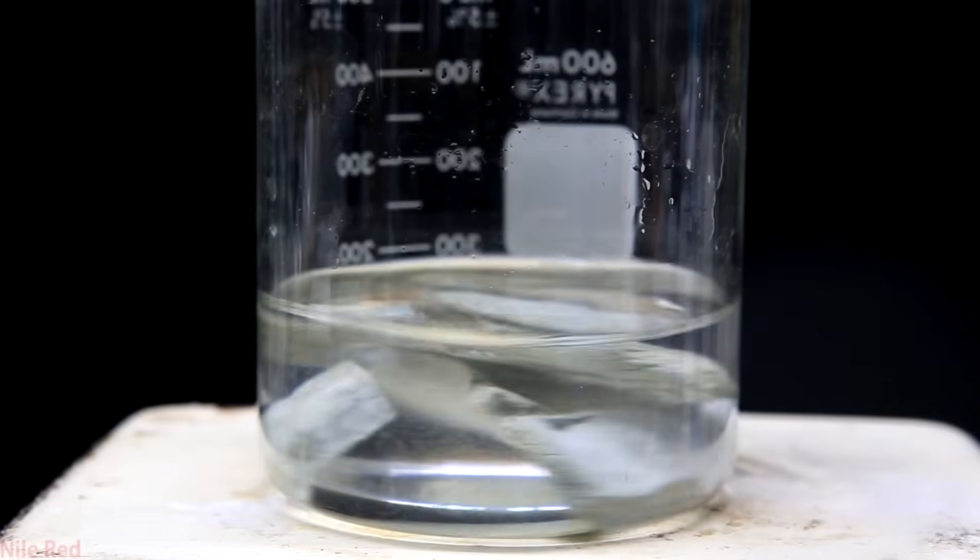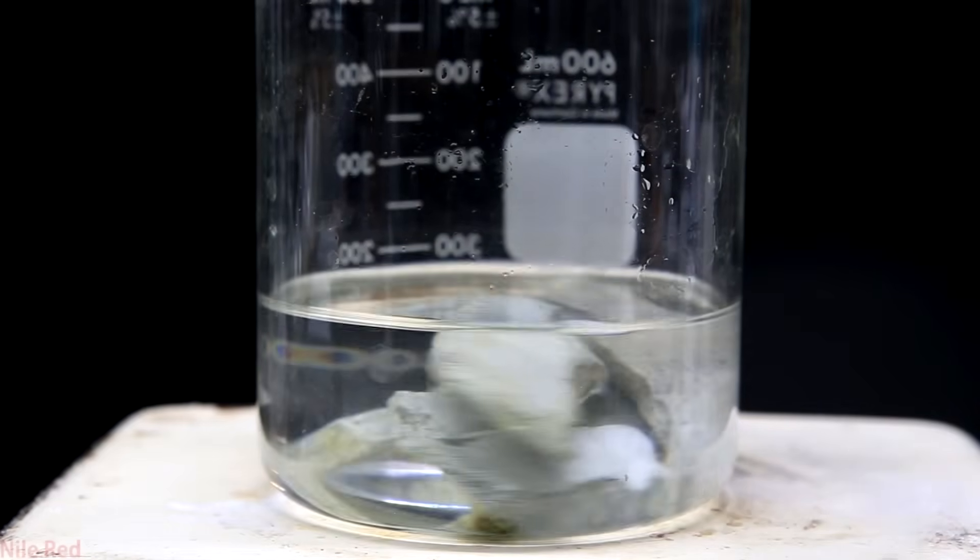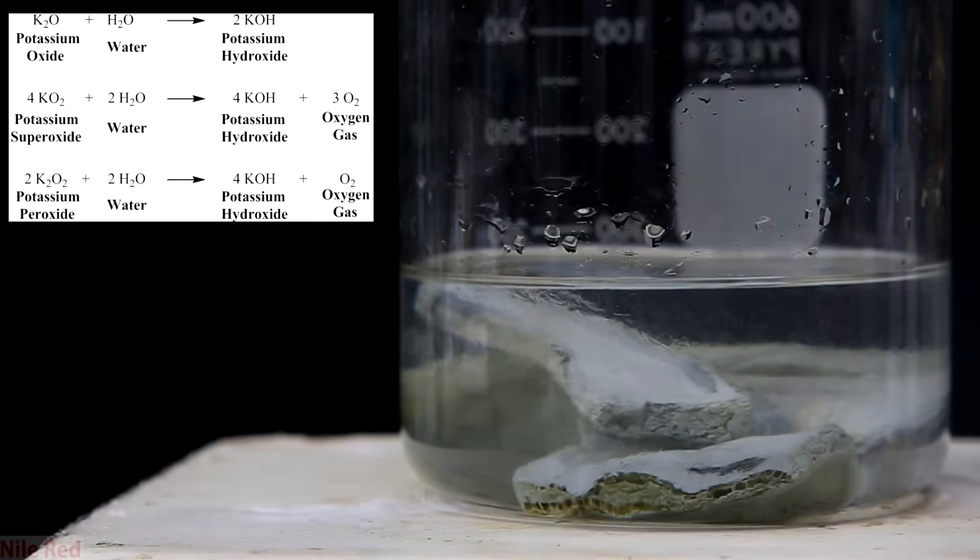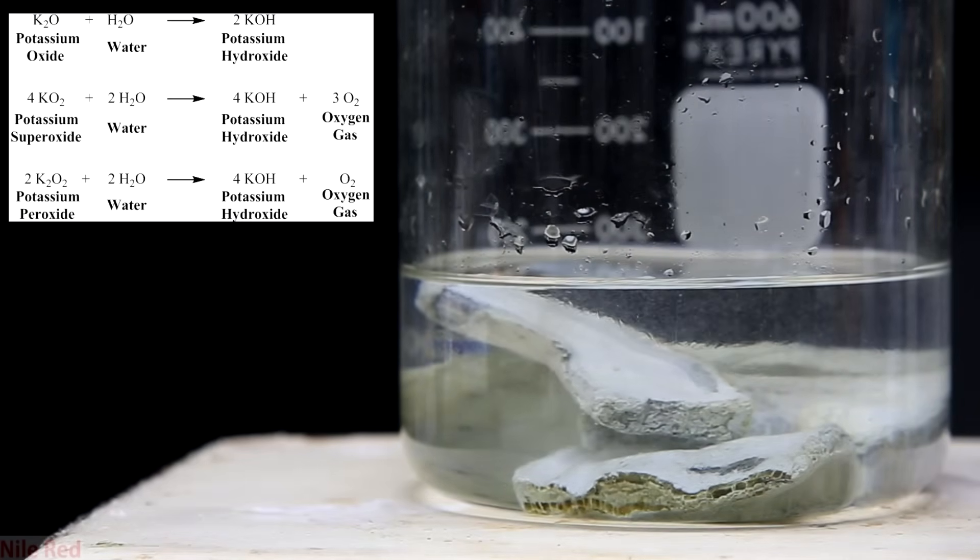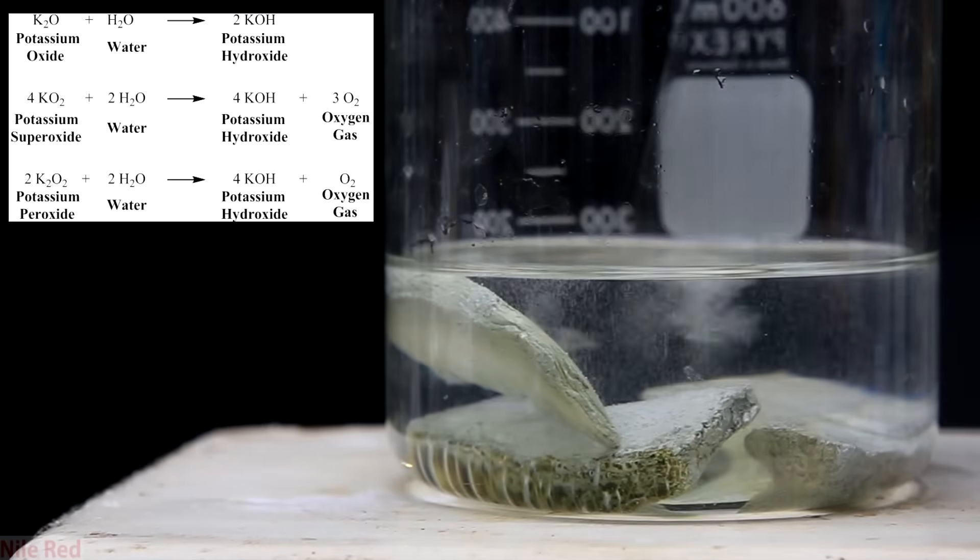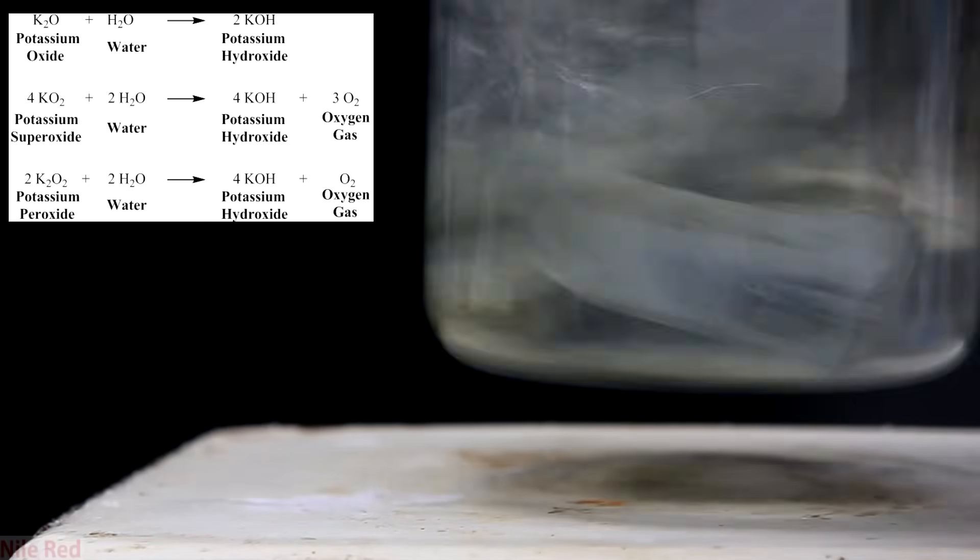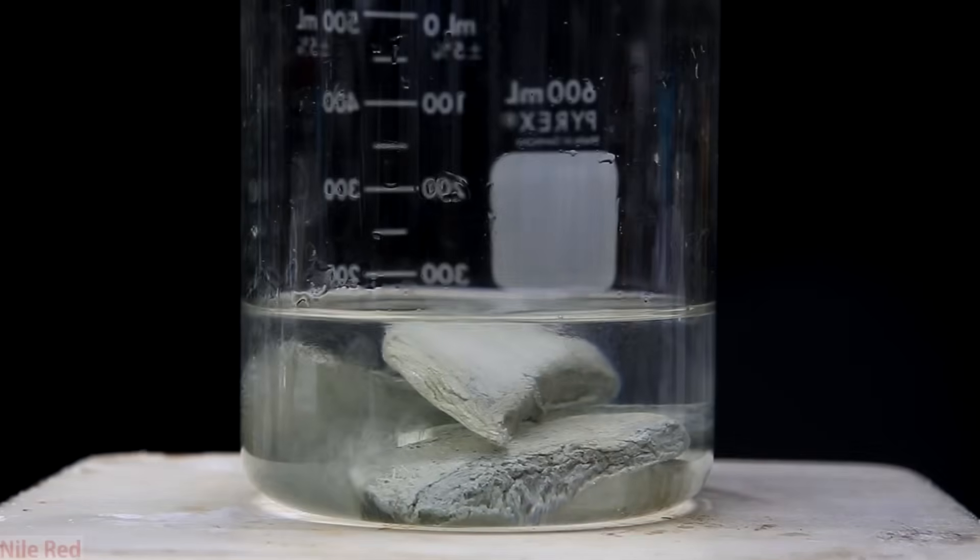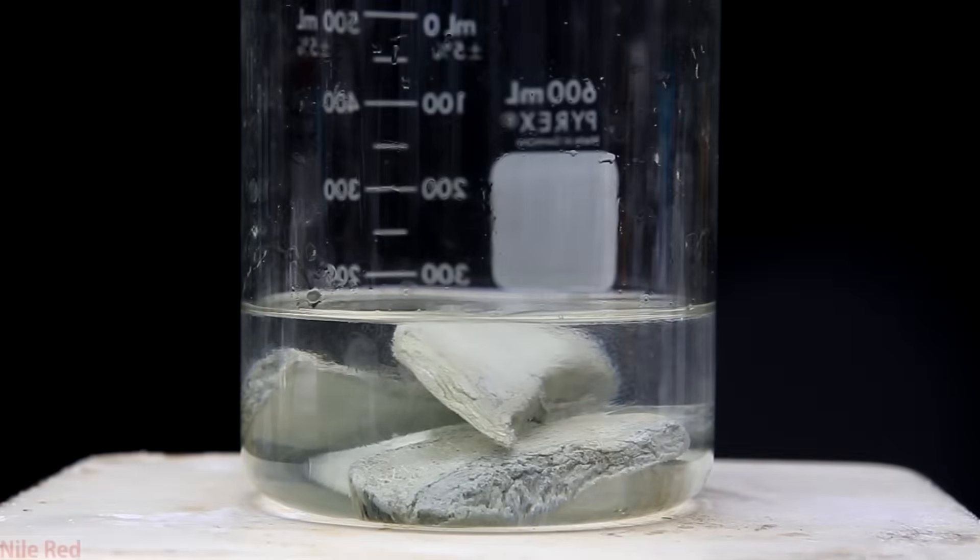I'll start with what I know for certain and then I'll move on to the more theoretical part. So this 99% isopropanol also has 1% water. It's very well documented that all of these oxides will react with water to form potassium hydroxide and in the case of the peroxide and superoxide it will also produce oxygen gas. So letting it sit with this very small amount of water, these oxides can react and they can be destroyed.